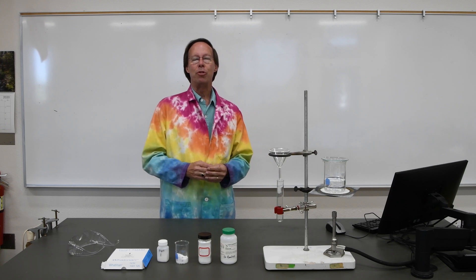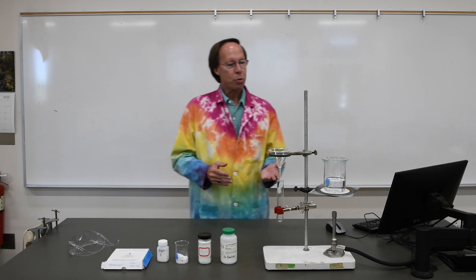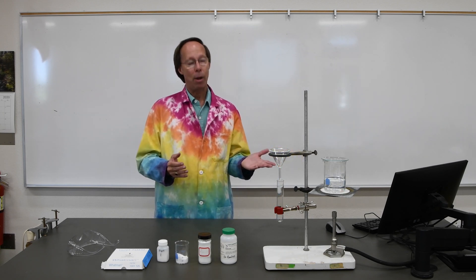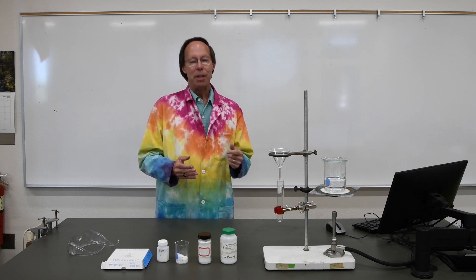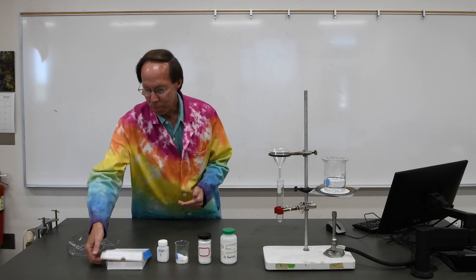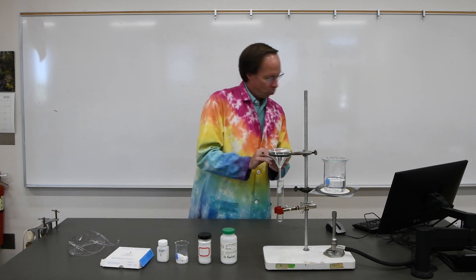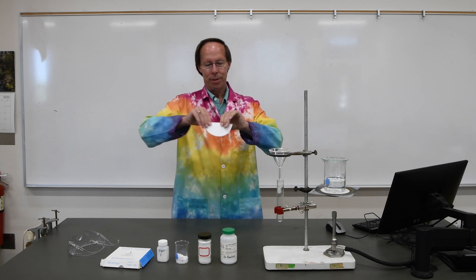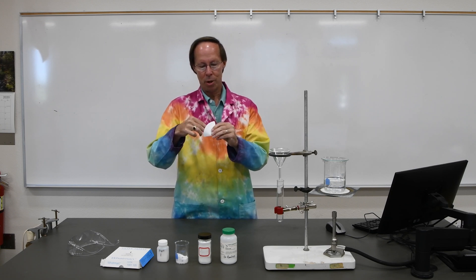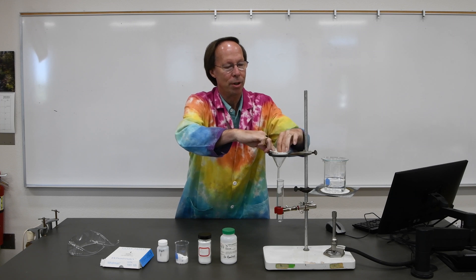Once we've determined the solubilities of each of these things, we should be able to separate our unknown mixture. We'll take the unknown in a test tube and first add some alcohol, swirl it around, and if the alcohol-soluble material is present, it should dissolve and leave the other two substances behind. To separate the alcohol-soluble substance, we're going to use a filter paper folded into quarters to make a cone that fits into our glass funnel.